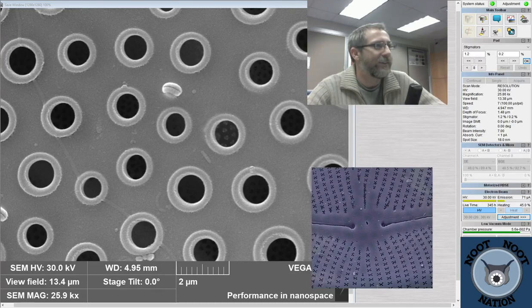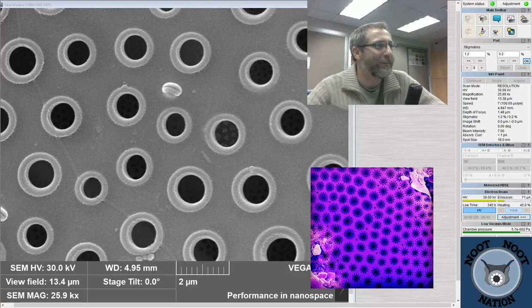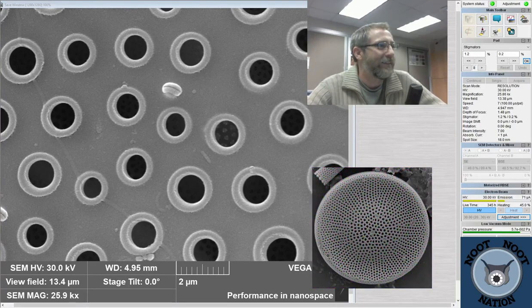So it looks like a coffee bean. Yeah, a little bit. A frowny face. Or a stomate. Yeah, those are science streams. That's a good catch. It does look a little bit like a stomate. Pulseption: shower head. It actually looks a lot like one of those shower heads.